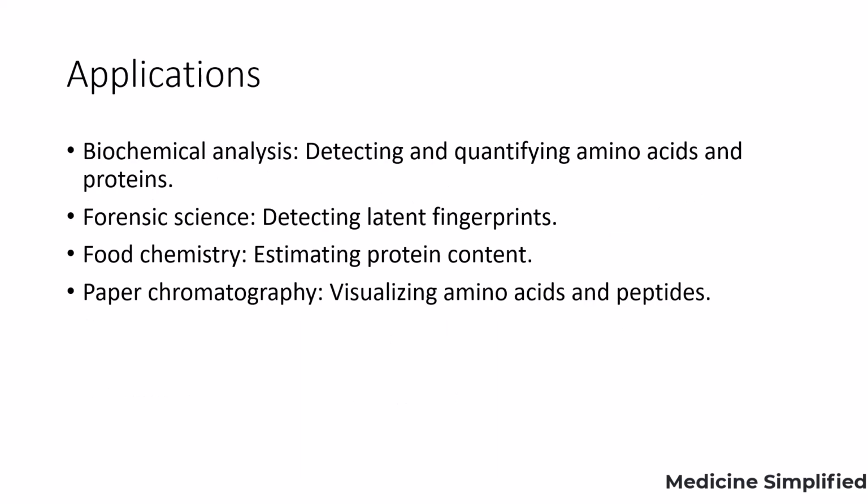Coming to the applications of the ninhydrin test, in biochemical analysis, it helps in detecting and quantifying amino acids and proteins. In forensic science, it helps in detecting latent fingerprints. In food chemistry, it helps in estimating protein content in foods. In paper chromatography, it helps in visualizing amino acids and peptides.